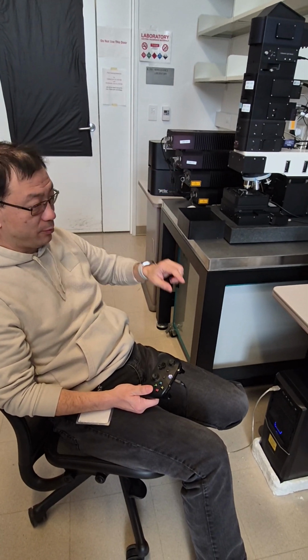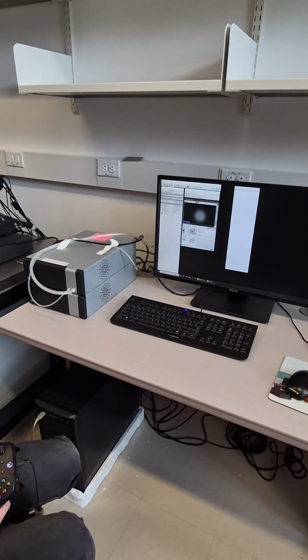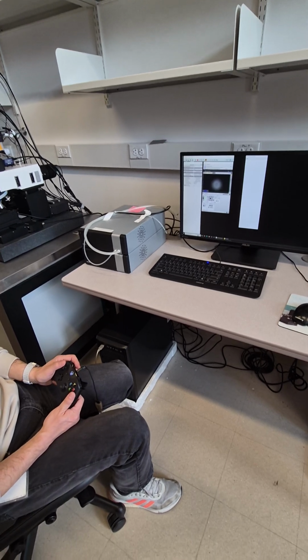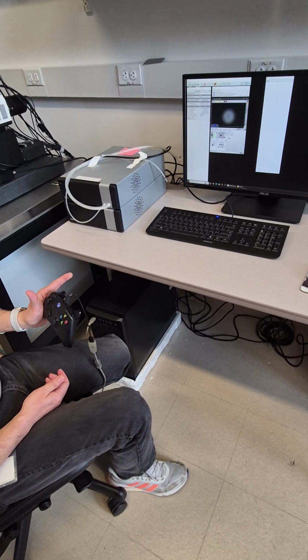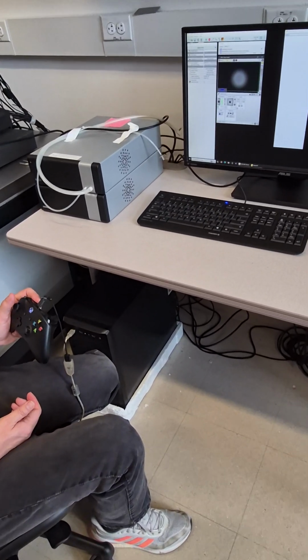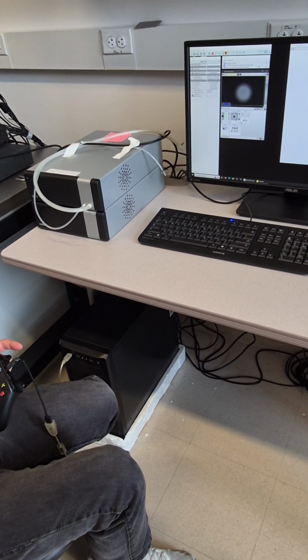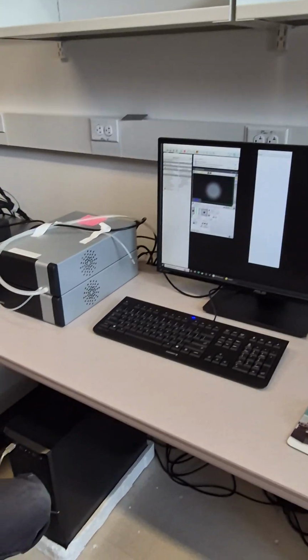And for this one, don't worry. You move up and look at this bright dot, and if you see it's even more blurry, that means you probably should move down. Right. Okay. So right now I can see I should move down, since it's much longer than the 9 mm. I use continuous, not turbo, so I don't do it for a long time. I just do maybe 1-2 seconds and stop, and I watch. It looks like the dot becomes bigger and the edge starts to get a little bit sharper, so that means you are going in the right direction.